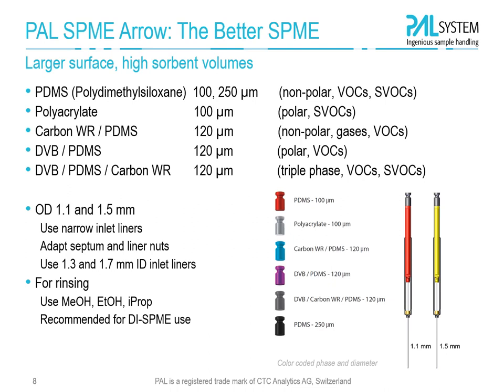For thorough cleaning, the arrows can be rinsed with solvents. This is recommended in particular for direct immersion experiments.